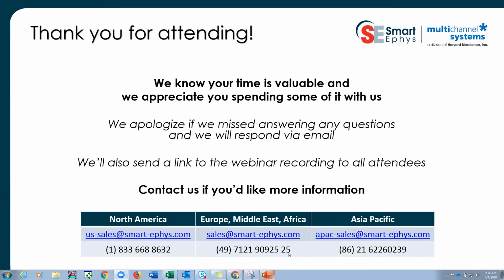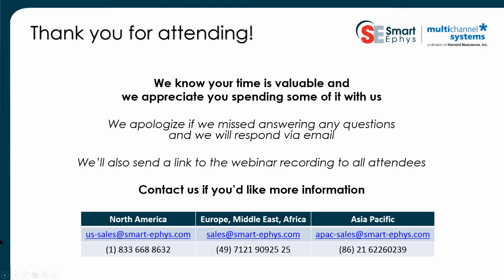A third question: what is the longest period established that islet cultures have survived on MEAs? What we published was until day 34 in vitro, but I did recordings up to 65 days.